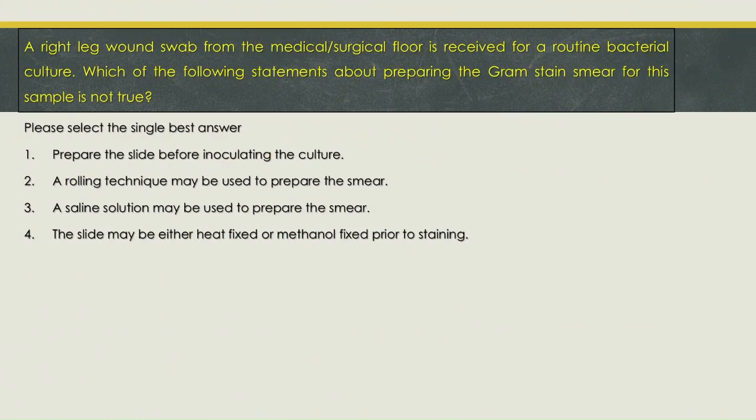A right leg wound swab from the medical/surgical floor is received for a routine bacterial culture. Which of the following statements about preparing the gram stain smear for this sample is not true? Please select the single best answer.